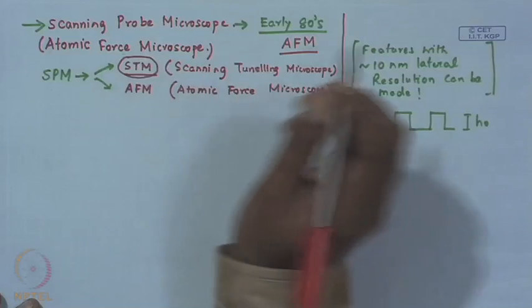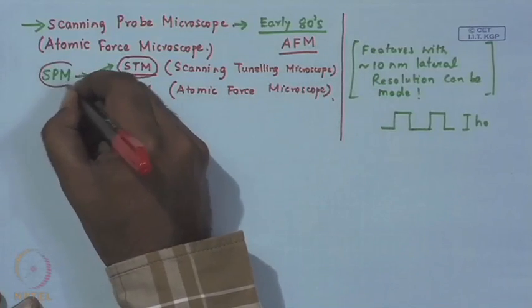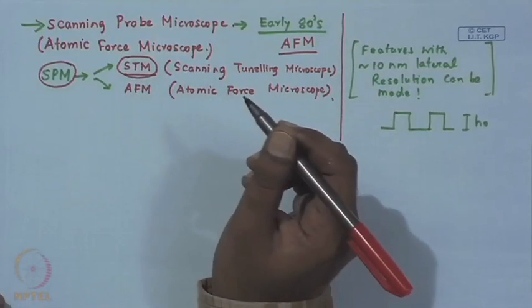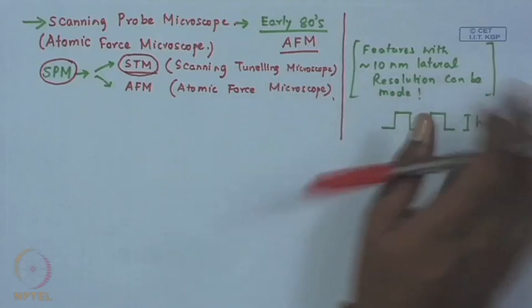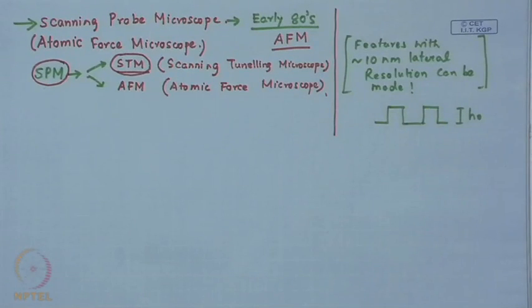So, we will talk about the AFM in much greater detail, but just to give you an introduction so that you do not feel left out. I do not know STM, but I talk about AFM. We do not realize that they fall into the same group of methods. I just spend a few minutes talking to you about STM. So, remember that AFM is a special class of scanning probe microscope, probably the most popular class of these methods, and let us see how an AFM works.